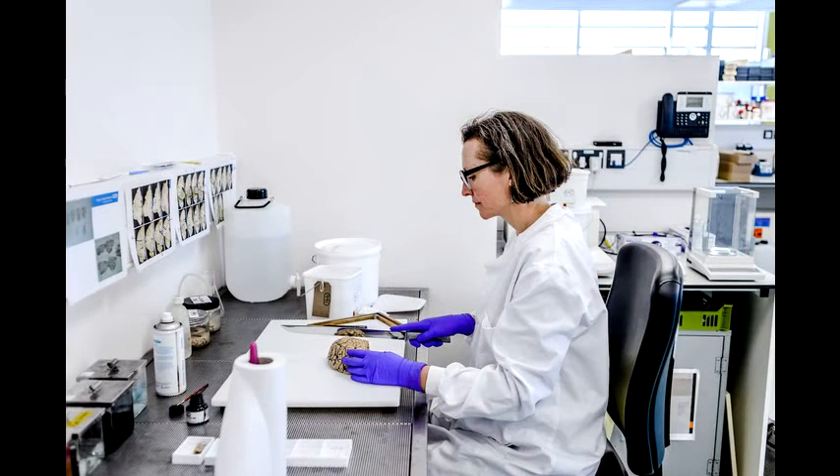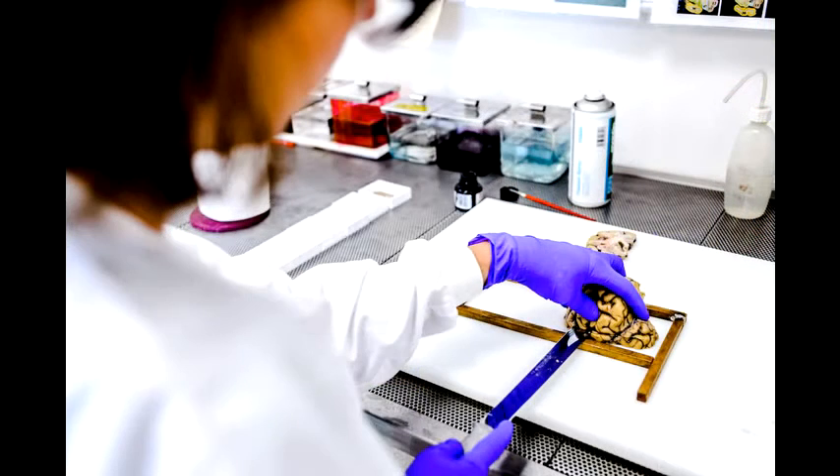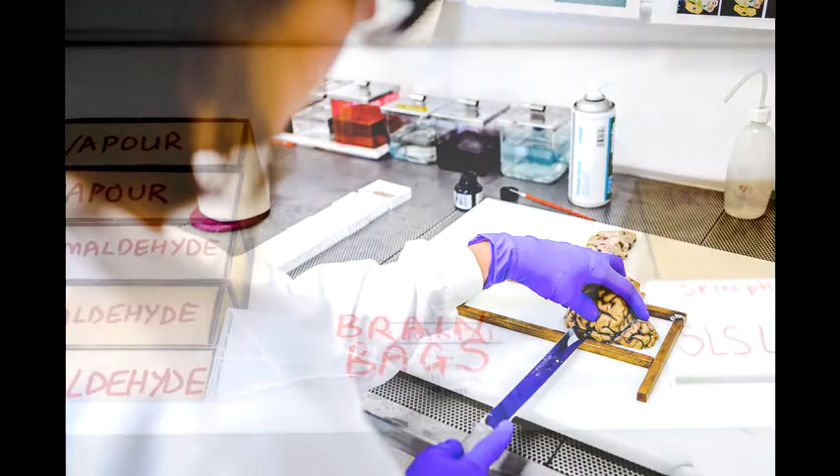The other half gets dissected immediately. That basically involves cutting the tissue into slices and then taking the areas of tissue that we know we're going to be using for research, separating that out and putting it into different tubes and bags.